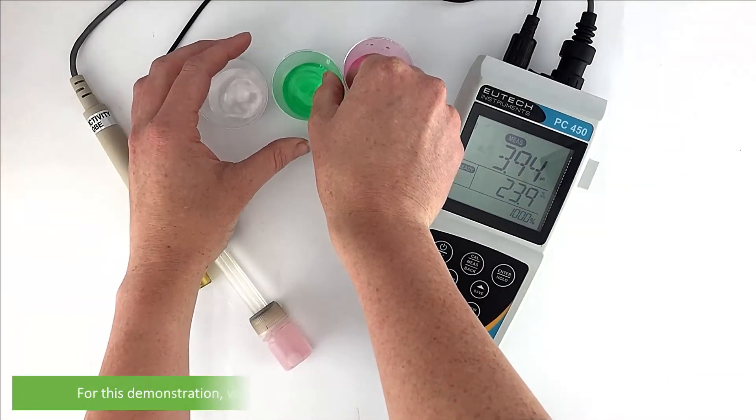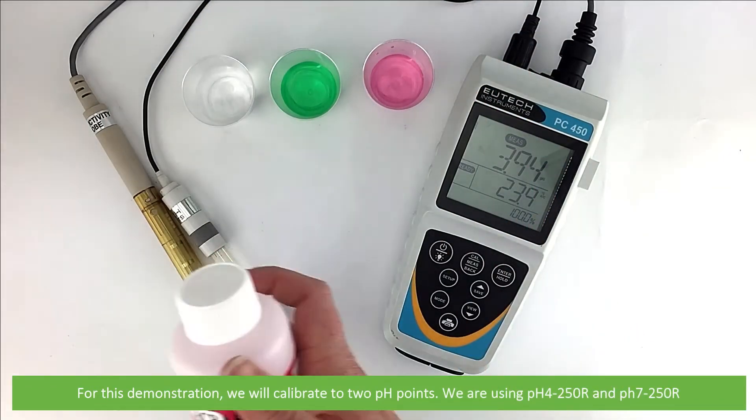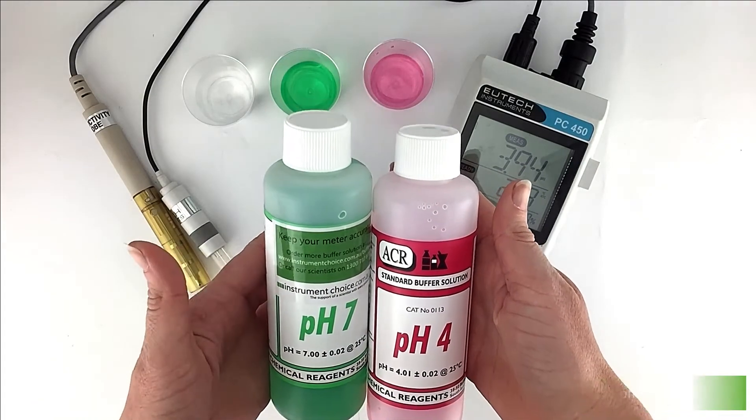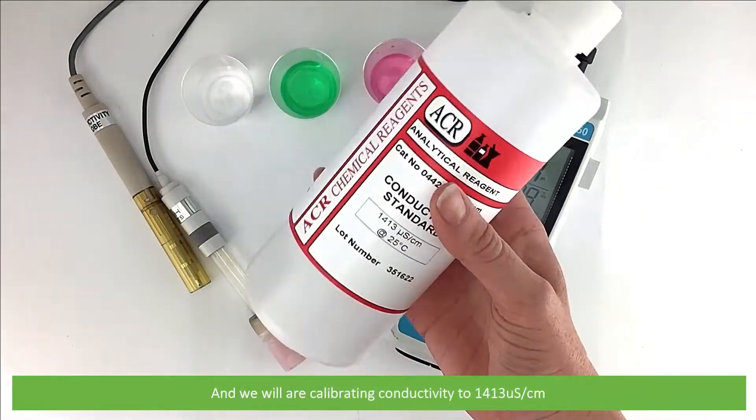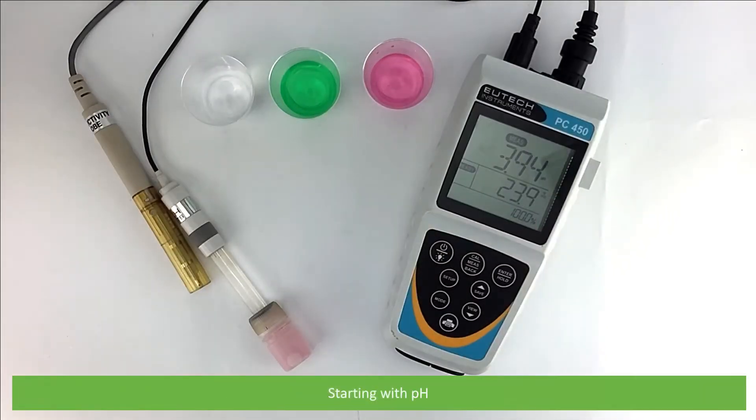For this demonstration, we'll calibrate to two pH points using pH4-250R and pH7-250R. We're also calibrating to a conductivity value of 1413 microsiemens per centimetre. We'll start with pH calibration.